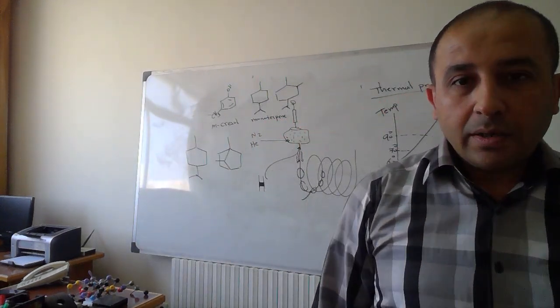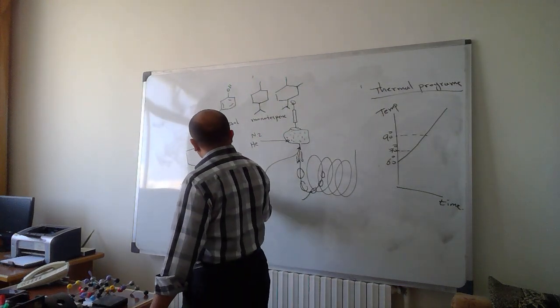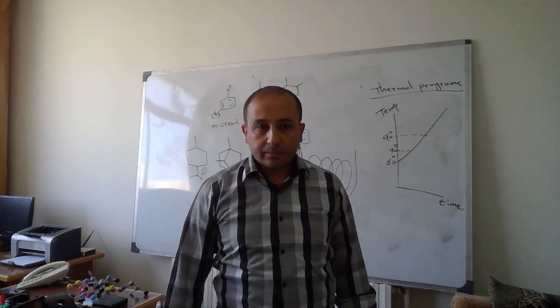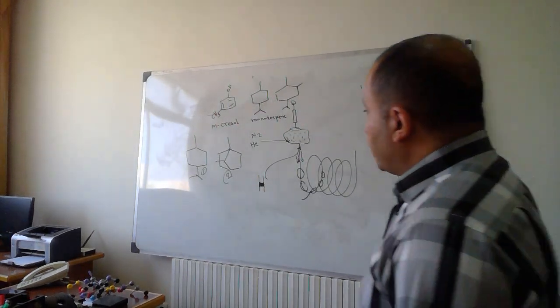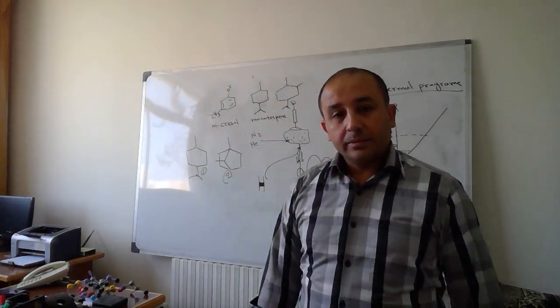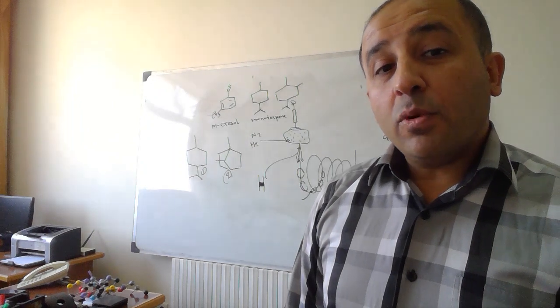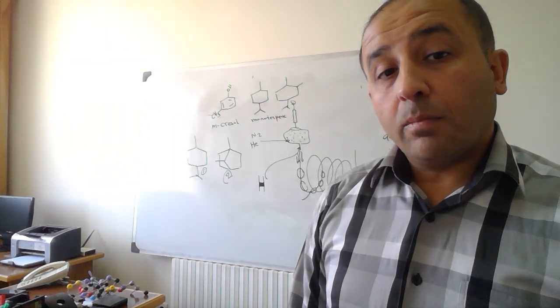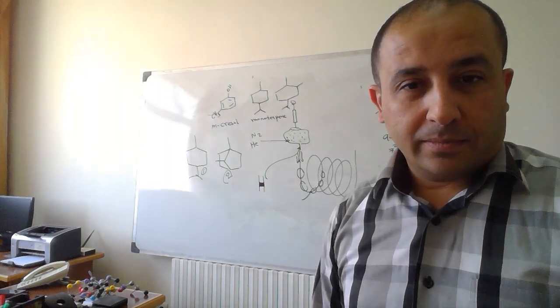Both are monoterpene. But obviously that one is linear, while two is more spherical. The movement of a spherical molecule should be faster than the linear one.